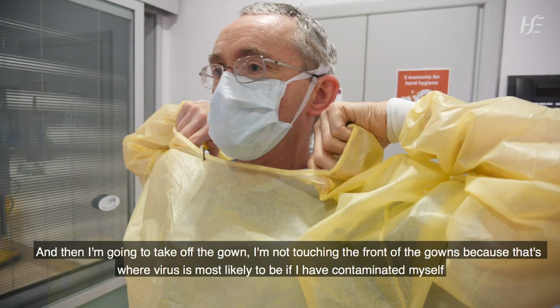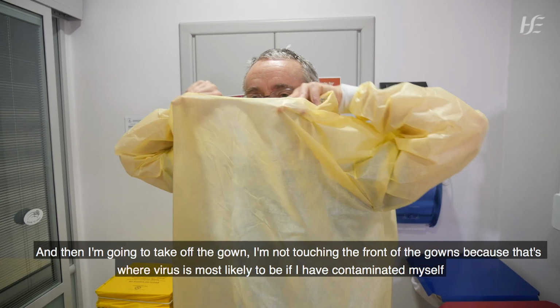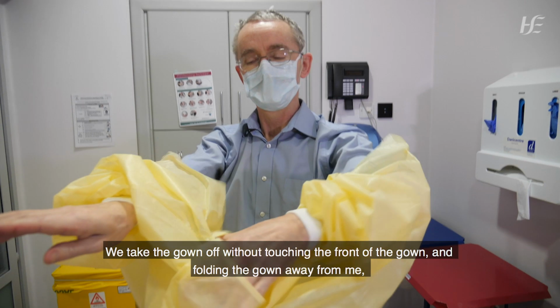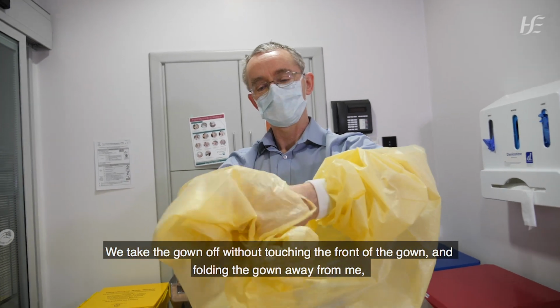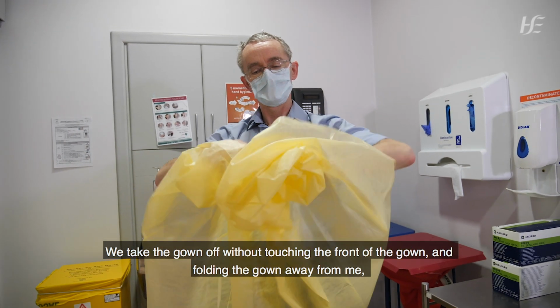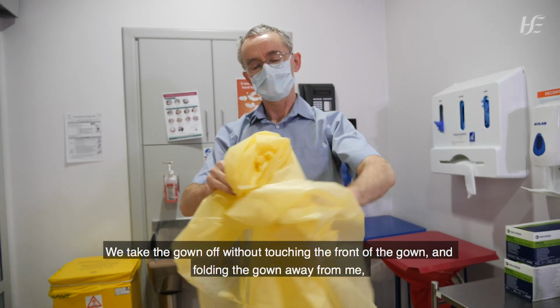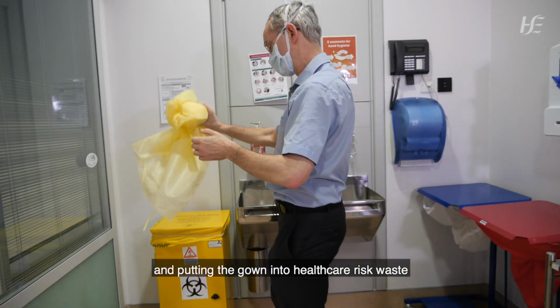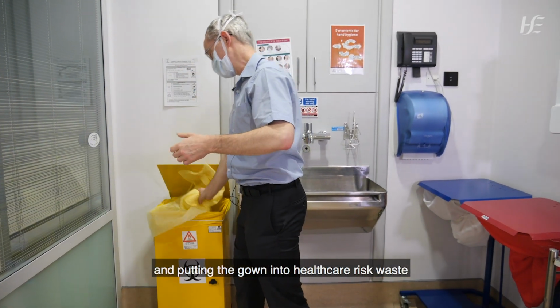And then I'm going to take off the gown. I'm not touching the front of the gown because that's where virus is most likely to be if I have contaminated myself. So we take the gown off without touching the front of the gown, folding the gown away from me and putting the gown into healthcare risk waste.